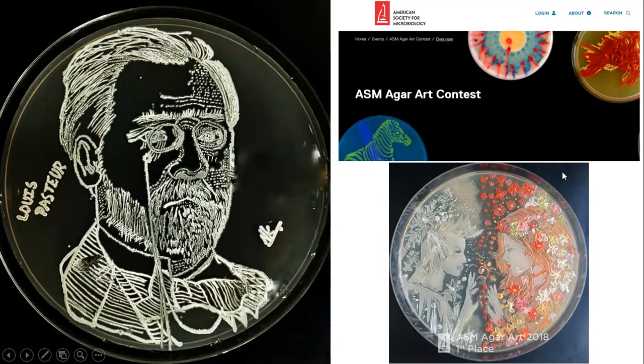These are the pictures you are seeing made out of bacterial growth, chromogenic and non-chromogenic bacteria. They have used them to make the picture. So the basic point is you need to have good inoculation loop skills, so that the rest of your experiments will be of good quality.